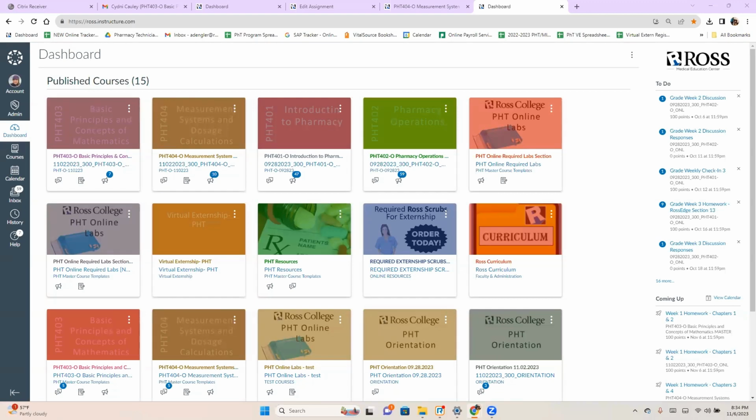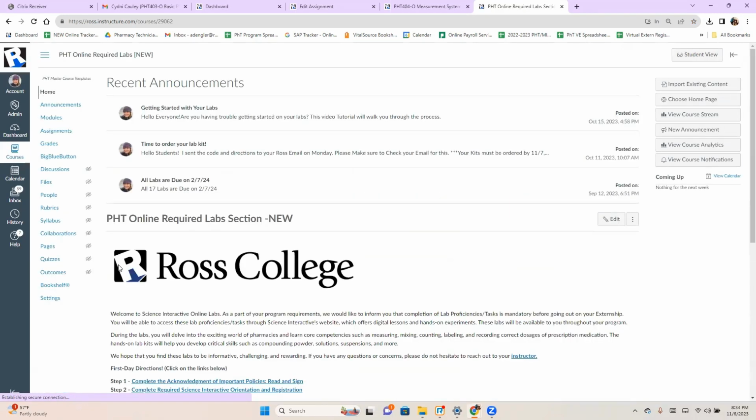Welcome, everyone. Today we are going to go over the lab safety lab on Science Interactive. First thing you always want to do is go in through the Canvas course. That's the only way you'll have access. So yours might look a little different, but you should still have a square box here that says PHT Online Labs. Click on that.